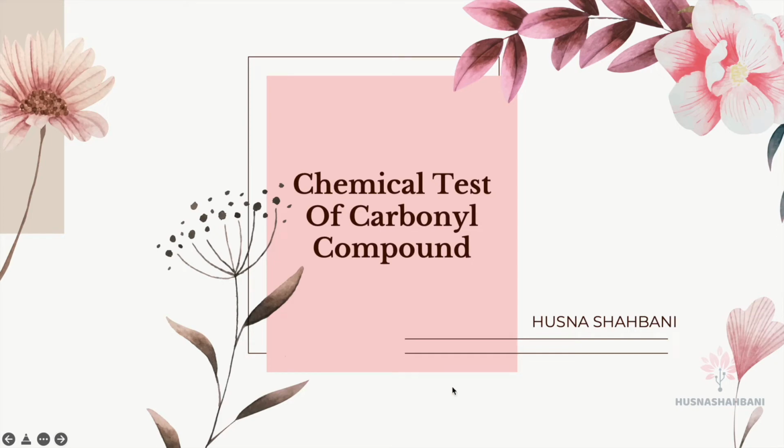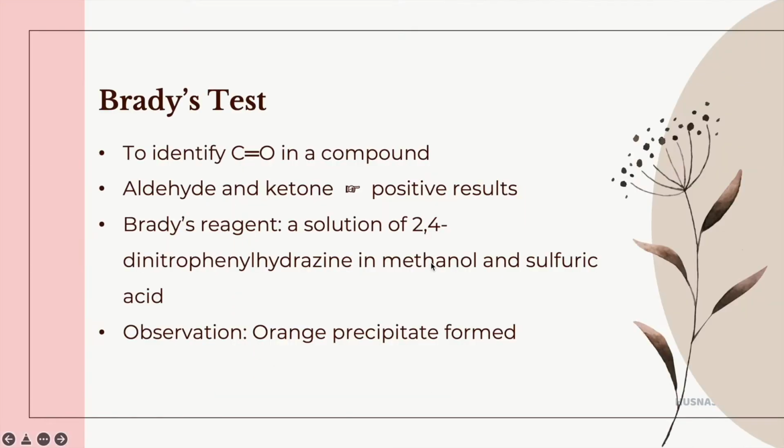Chemical test of carbonyl compounds. Brady's test is used to identify C=O in a compound, which means it can detect aldehyde, and it can also detect ketone because both classes of compound have C=O.